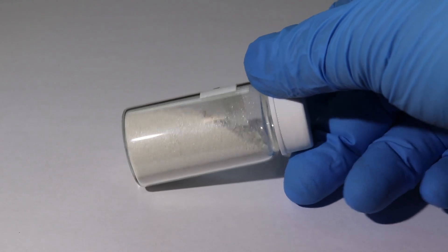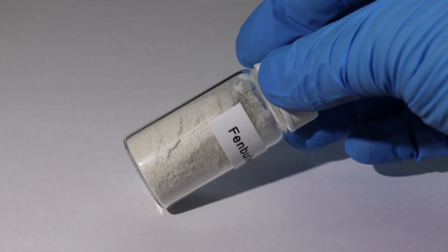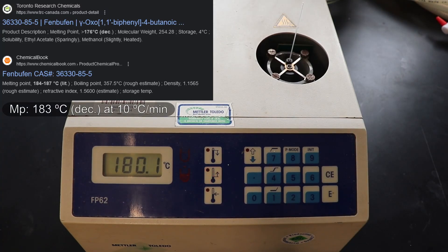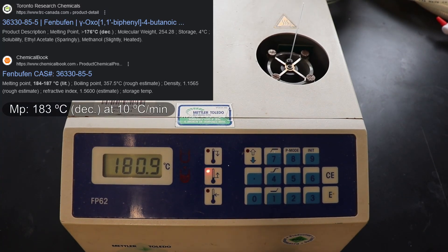Now that I have a product that seems to be decently pure, I'm going to have to run some tests to figure out if it actually is fenbufin. The first thing I tested was the melting point. Now the literature lists the melting point between 184 to 187 degrees Celsius.